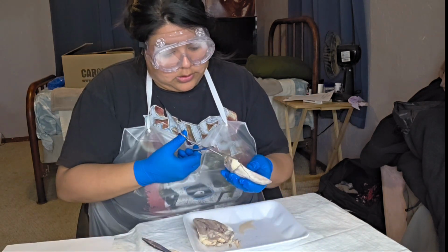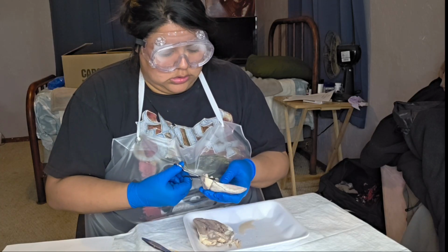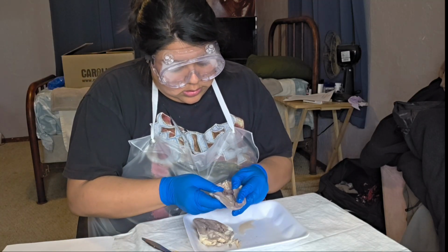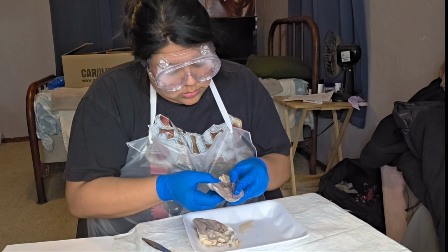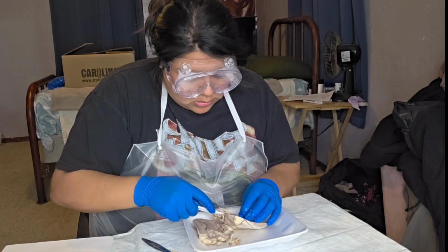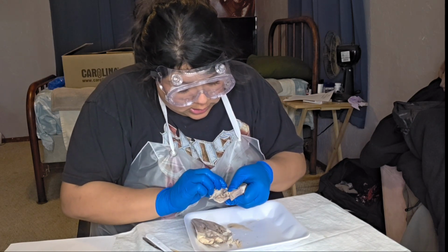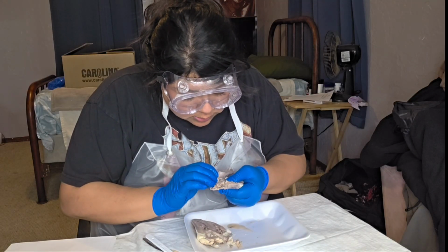Okay, so let's cut through those. So we cut open into the aortic valve, and we can see where it connects to that artery right in here.